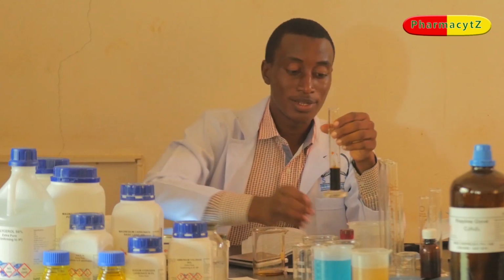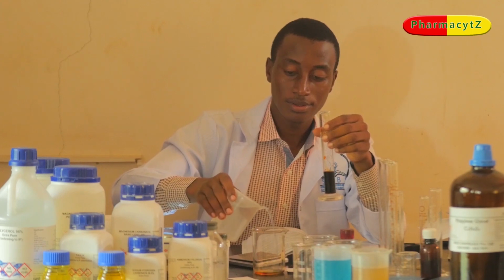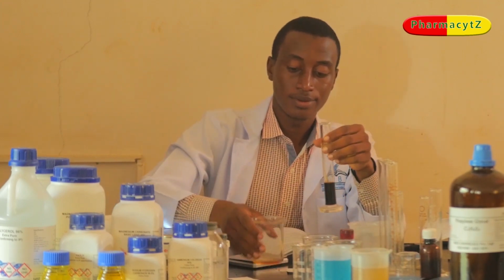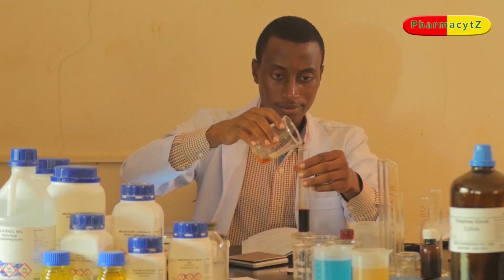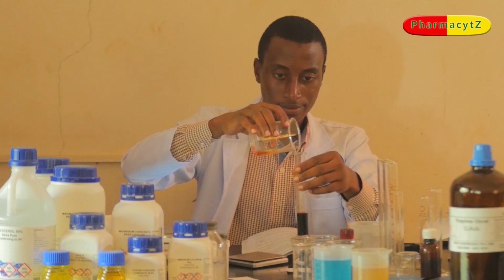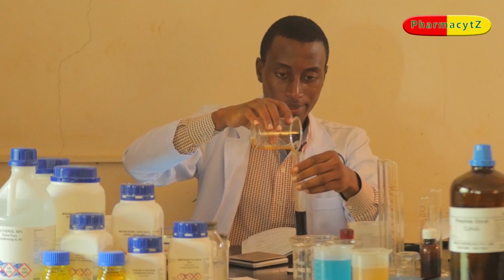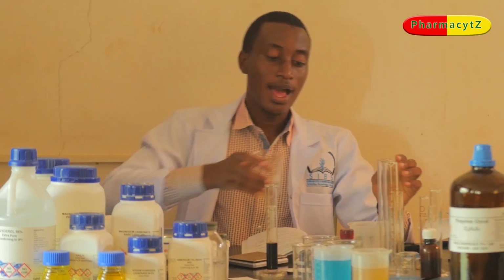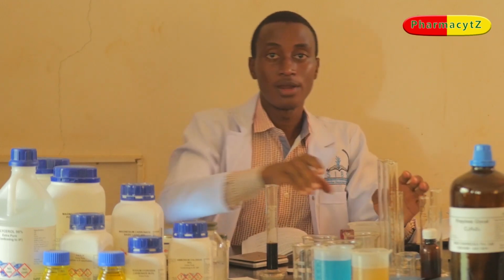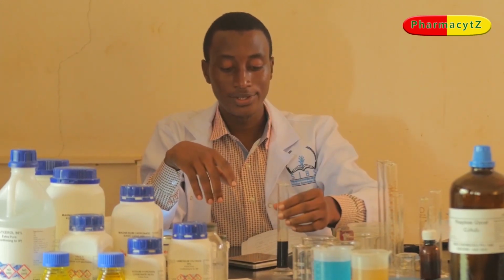It's about 20, but not yet 20. You can add just some amount also. This is exactly 20 mL of aqueous iodine solution. Now, while measuring, we should take into account the meniscus. Read carefully the meniscus while measuring the preparation.